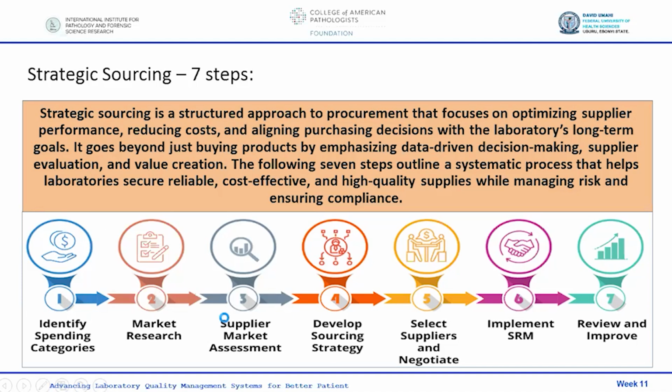Then you go ahead and do a supplier market assessment. You assess your suppliers. We've mentioned this before. Then you develop a sourcing strategy. Then you go ahead and select your suppliers and negotiate. After negotiating with your suppliers, you can now go ahead and develop a relationship, what we call supplier relationship management. It's very important. Then you review and improve as time goes on.